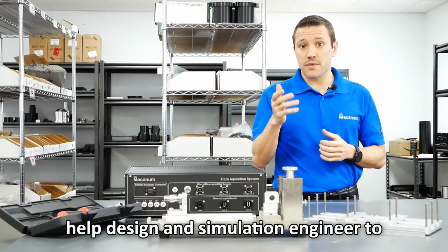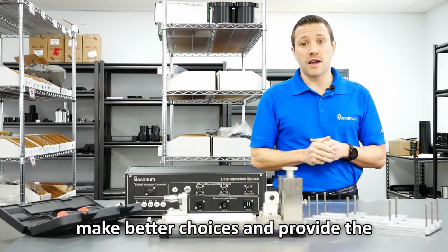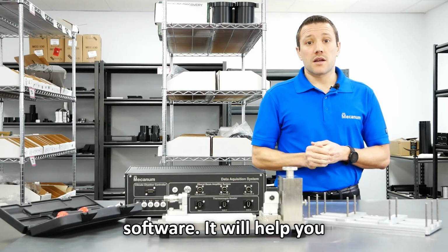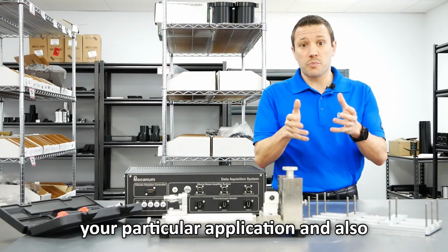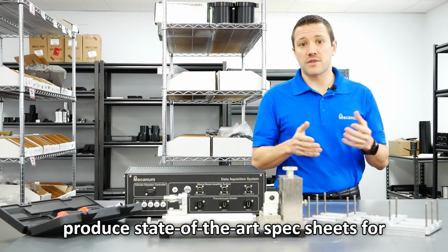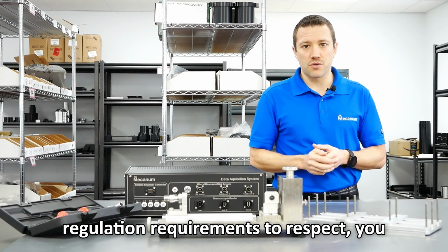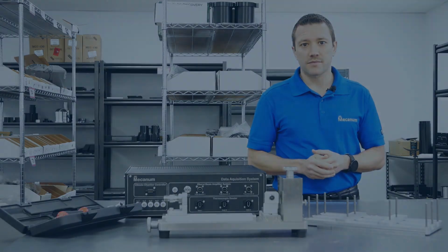It will also help design and simulation engineers to make better choices and provide the key parameters to input in simulation software. It will help you select material tailored to your particular application and also produce a state-of-the-art spec sheet for your customer and increase customers' trust. Finally, if you have specific regulation requirements to respect, you will have ASTM-backed data to do that.